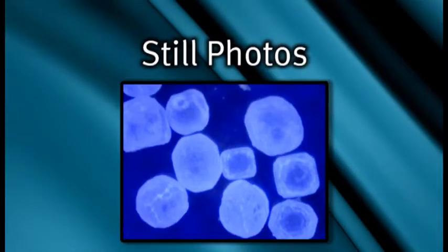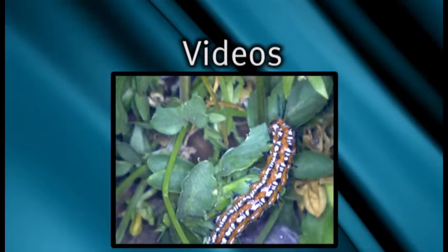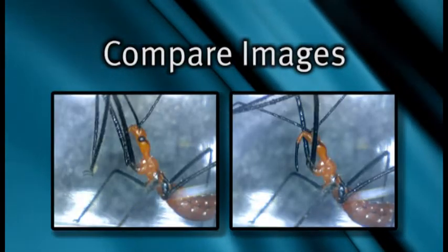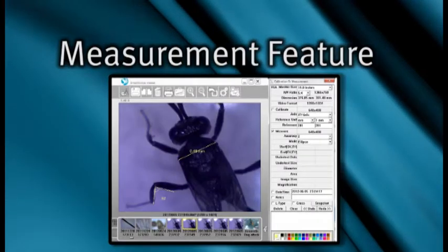In addition to still photos, you can record videos, record time lapse videos, compare two images side by side, and it even includes a measurement feature.